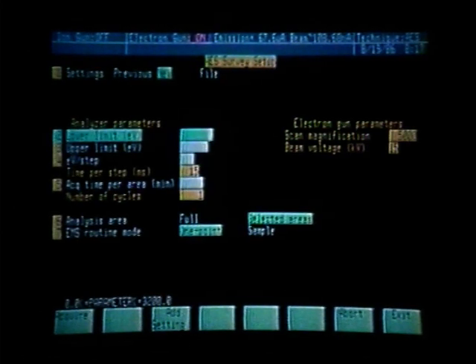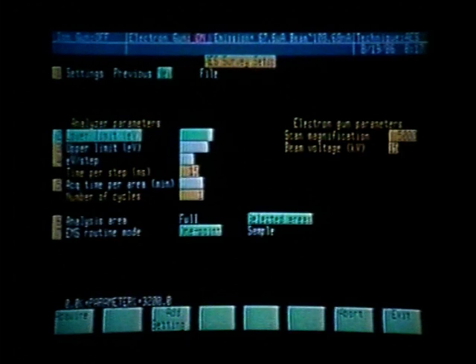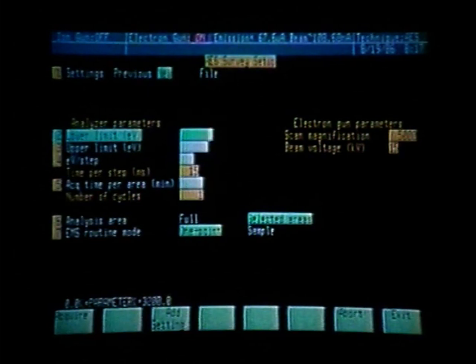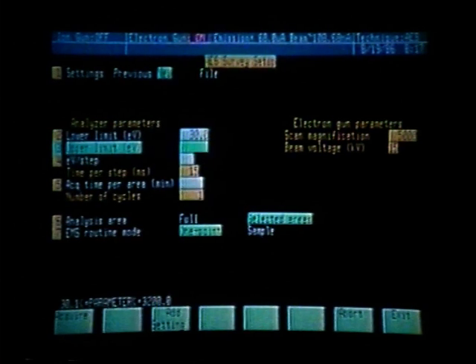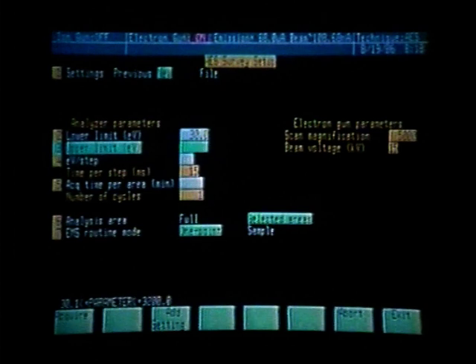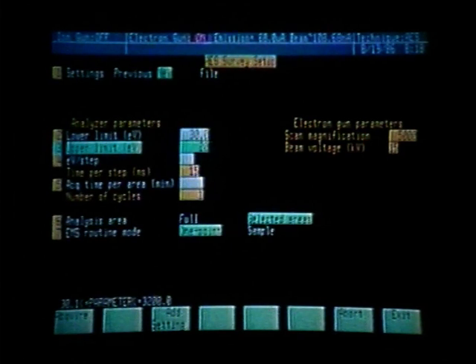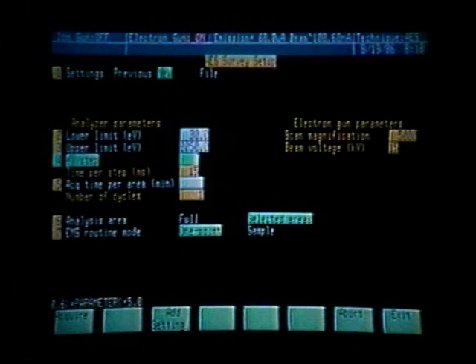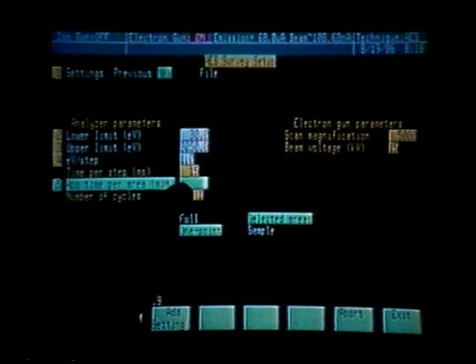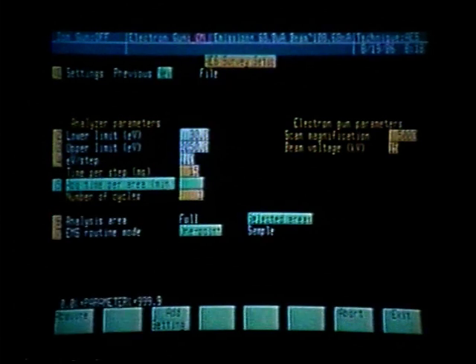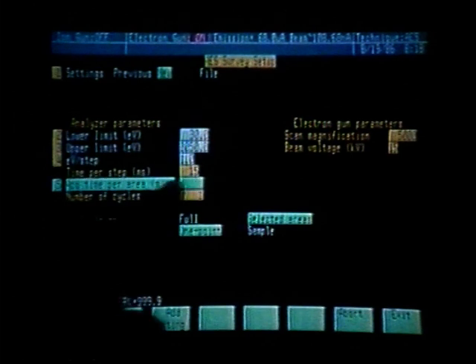That now allows us to fill in the rest of the analyzer parameters for collecting the survey scan. Since we're not sure what this material is, we would like to take a survey scan using a lower limit of 30. We then would like the upper limit to be at least 2,000 — let's make it 2,050 in case there are major peaks above 2,000. Typically we use one eV per step. The time per step is already entered; we set that up in the semi-permanent commands at 15 milliseconds per step.